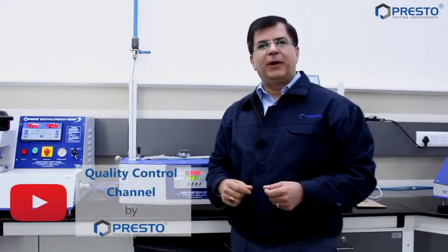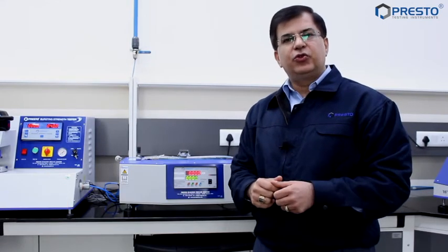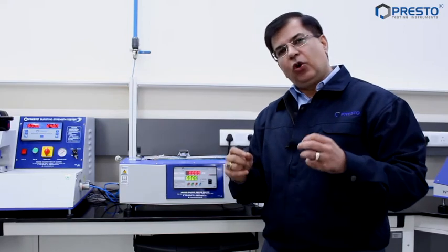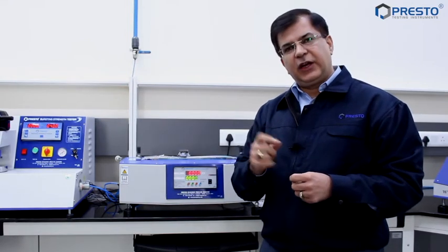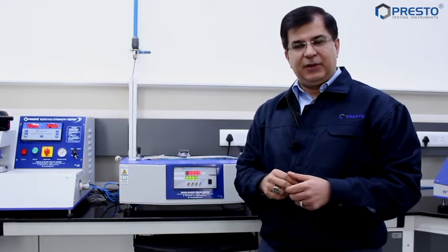Hello and welcome to yet another episode of Quality Control by Presto. We are committed to helping you choose the right equipment for your laboratory. My name is Vishal Malhotra and I'm your quality coach. Today we're going to talk about the coefficient of friction, which is a very important instrument in your laboratory in case you're dealing with laminates.